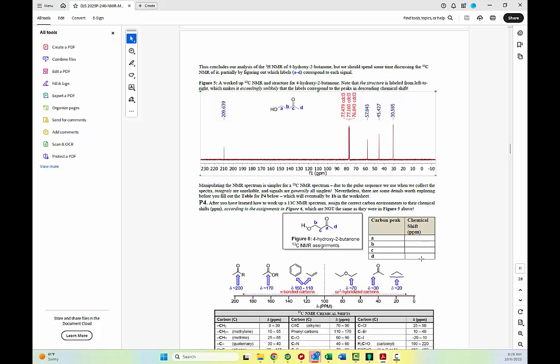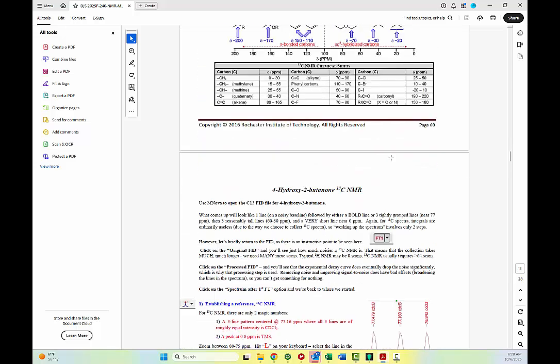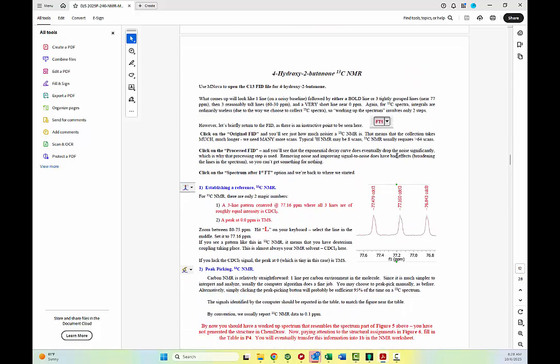Where are those peaks? Because all of those peaks are singlets, we don't perform integration, and since they're singlets, there are no J values. That turns out not to be true all of the time. It's largely true because of the way we choose to run the spectra. But if you want to know more, there's a video that describes why we run the spectra the way we do. But for now, know that the typical C13 NMR experiment just simply will have singlets, no integration, no multiplicity, and so on. And so walking through this set of instructions, I'm going to do that in MNova now.